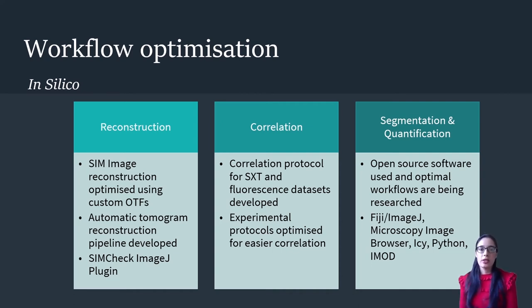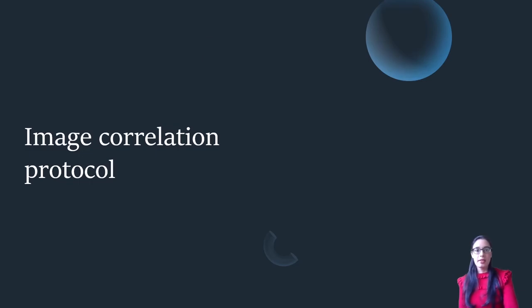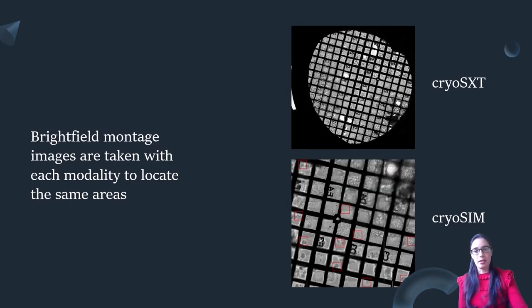On the correlation side, we've worked with the developer of EC-CLEM, Dr. Perrine Paul-Gilloteaux, and she's developed a protocol specifically for correlating SXT and fluorescence datasets. And on the segmentation side, we're looking into using open source software. So now I'll show you the image correlation protocol.